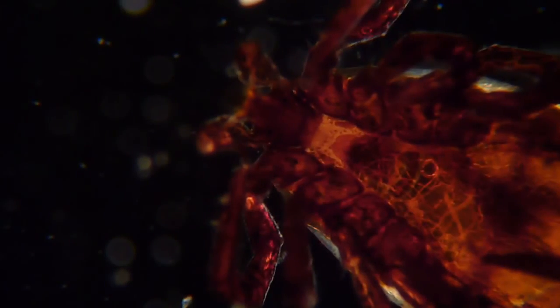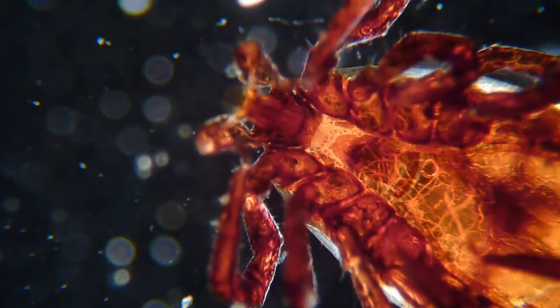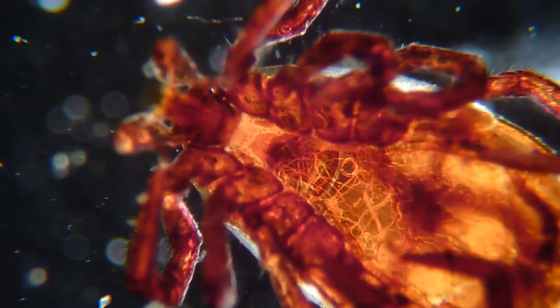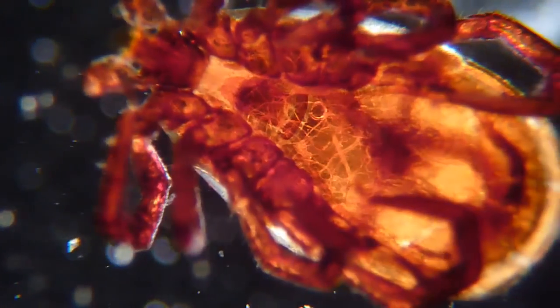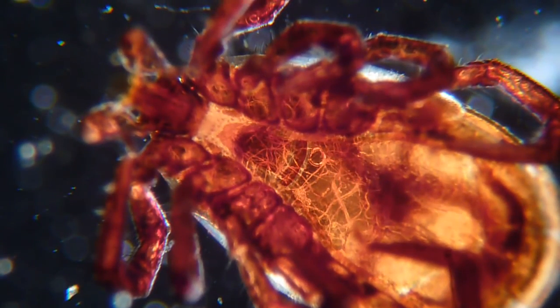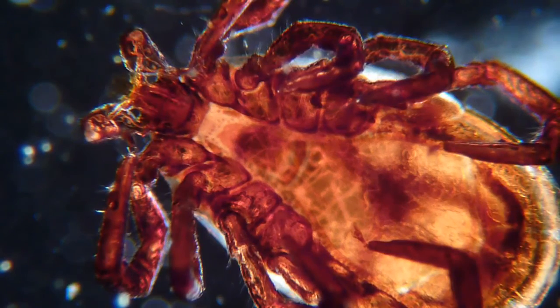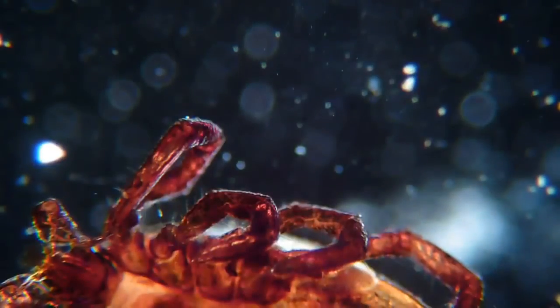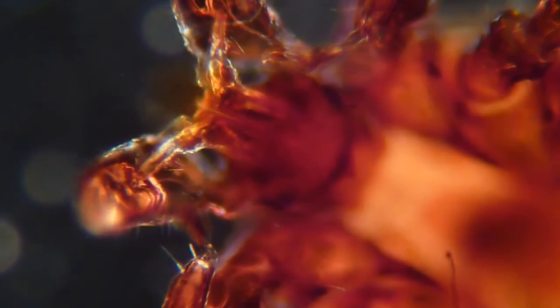That's the dark field. I need to increase the light a little bit. You see that you have a totally different view now. The object appears bright on dark background. All those white spots that you see, well that's dust. You see how sensitive dark field is in relation to dust. But now you can also see much better the place where the legs connect to the body. Let's go up one higher. That's this one over here. And again the head.